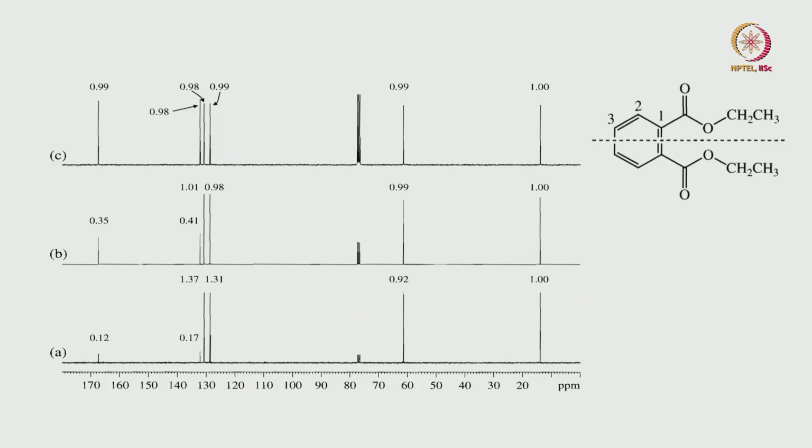So that is what I was telling you: the number of peaks that you are going to get in the carbon 13 and its intensity depends upon relaxation and the symmetry of the molecule. How do you know it depends upon relaxation? This is an example now.